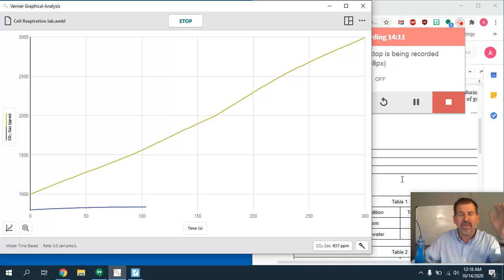All right, once again, we don't need to sit here and let this run for the whole time, so I'm going to pause it, let it run, and I'll be back in a couple minutes.